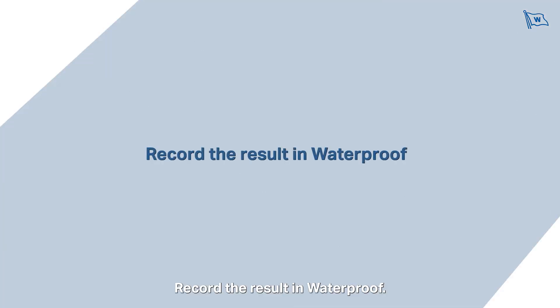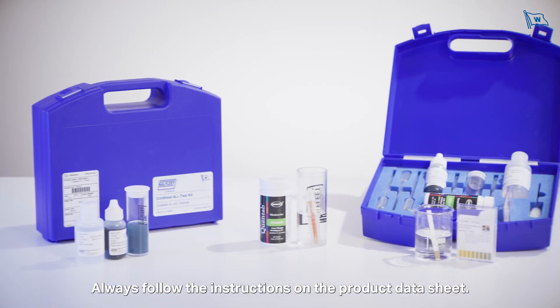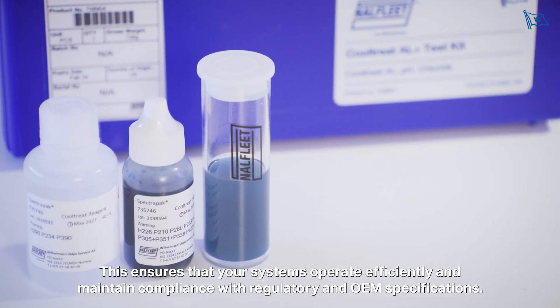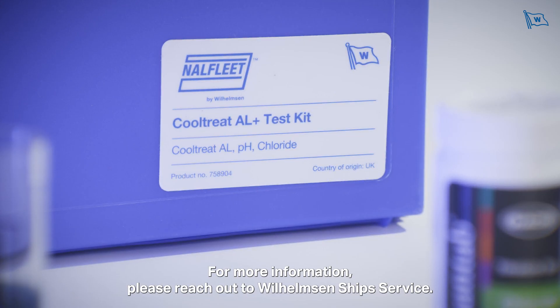Record the result in waterproof. Always follow the instructions on the product data sheet — this ensures that your systems operate efficiently and maintain compliance with regulatory and OEM specifications. For more information please reach out to Wilhelmsen Ship Service.